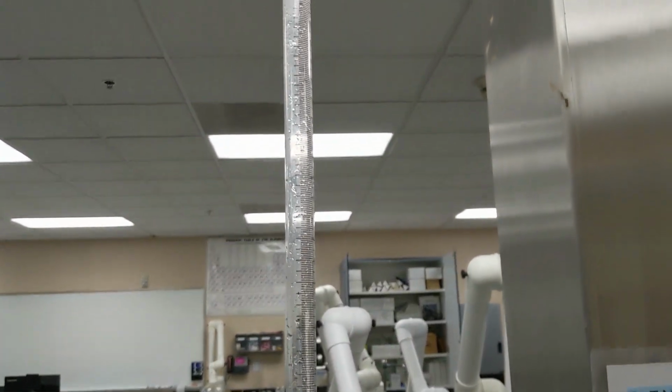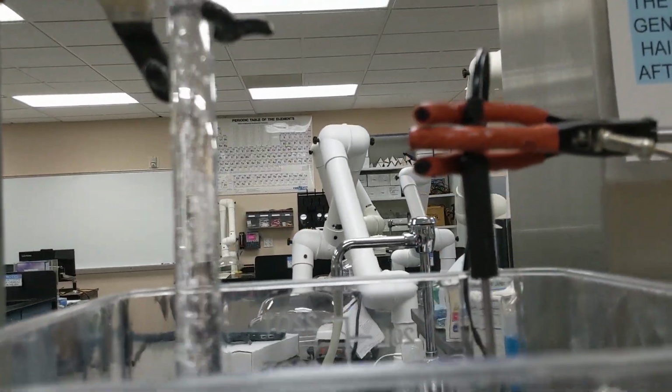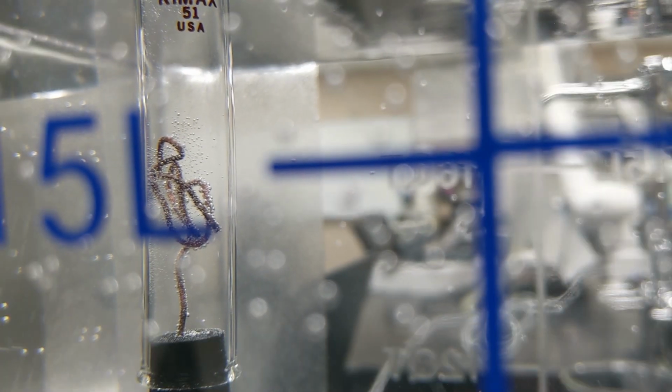So the bubbling's pretty robust now. We'll probably be done with this trial in a few seconds. A little piece of magnesium broke off though. Okay, so it looks like the reaction's complete at this point.